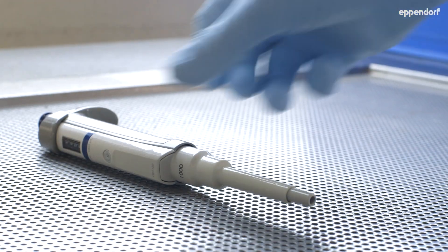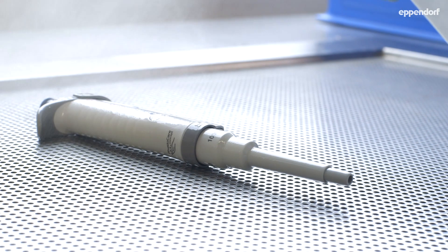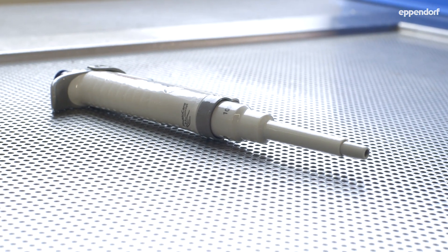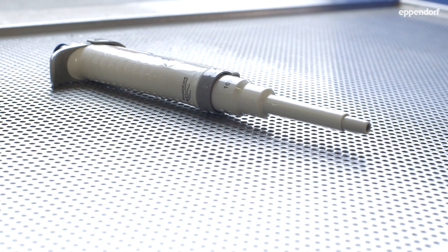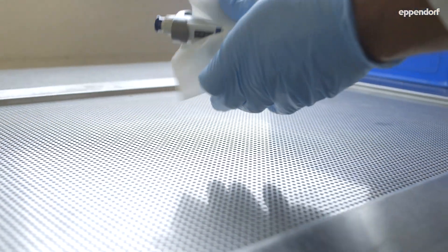After verifying the customer's declaration of decontamination, all pipettes go through an additional Eppendorf decontamination process before they are forwarded to our calibration facilities.